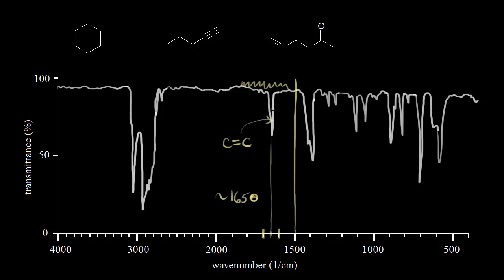So a carbonyl, we would expect that to be just past 1,700 and also much, much stronger. So we can rule out this molecule over here because I don't see any kind of a carbonyl stretch. So let's look in the triple bond region. So somewhere in here, I don't see any kind of a signal. So it couldn't possibly be this molecule. So we must be talking about cyclohexene here.